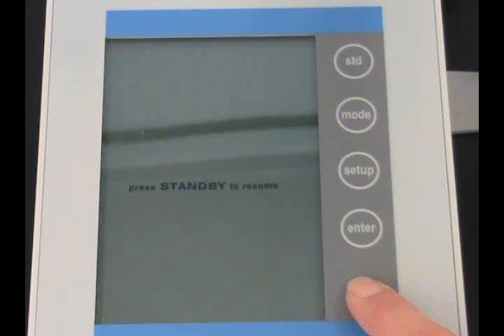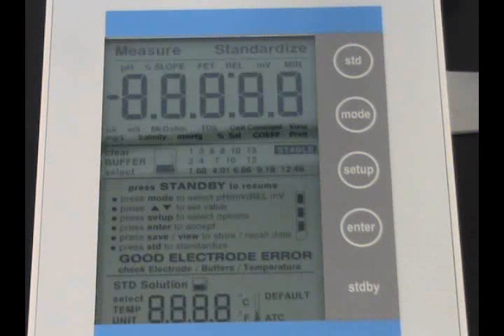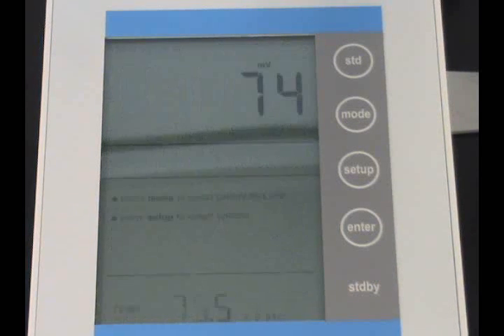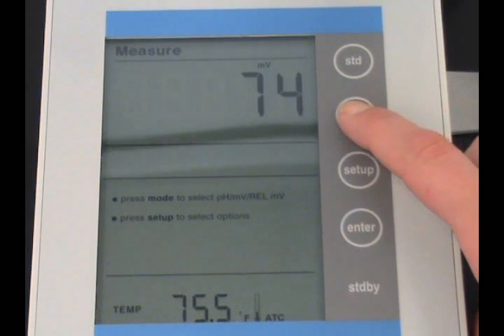Turn the meter on by pressing the standby button, located on the lower right side of the screen. Press the mode key until the display reads pH mode.